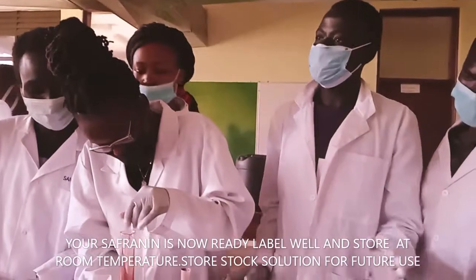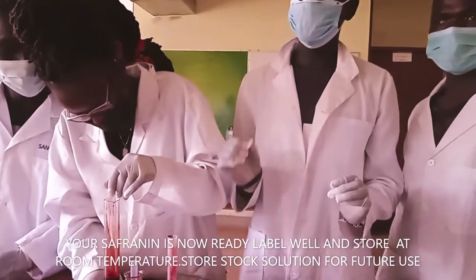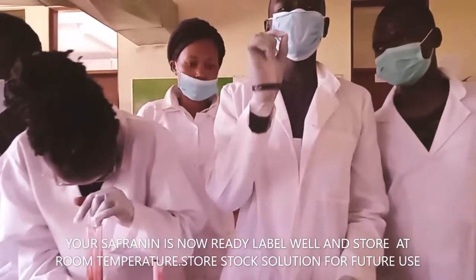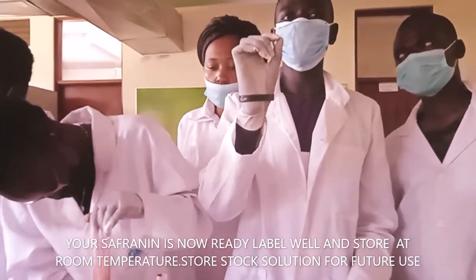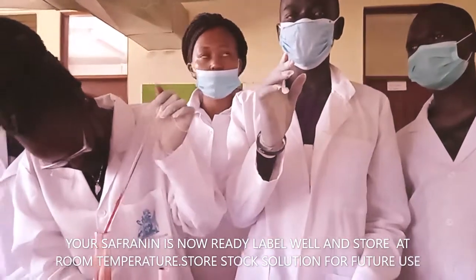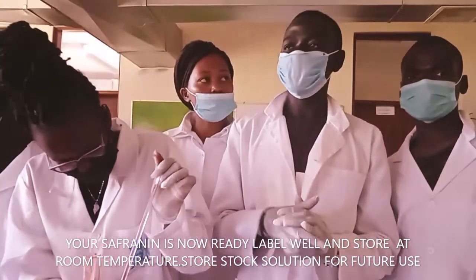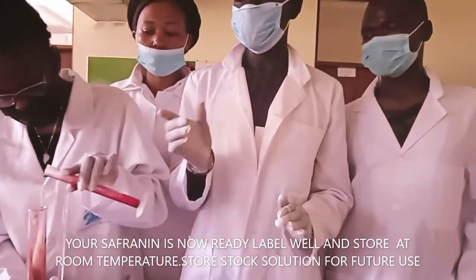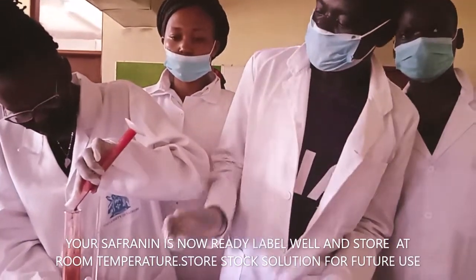So that you can differentiate between gram-negative and gram-positive bacteria. It can also be used to visualize the pseudo-hyphae. That's why when you are going to talk about Candida albicans, it is one of the organisms diagnosed using this technique.